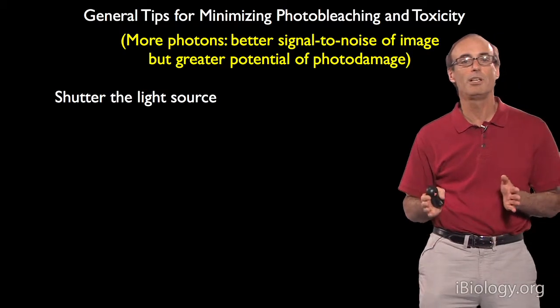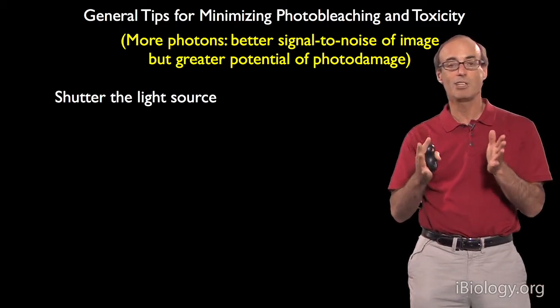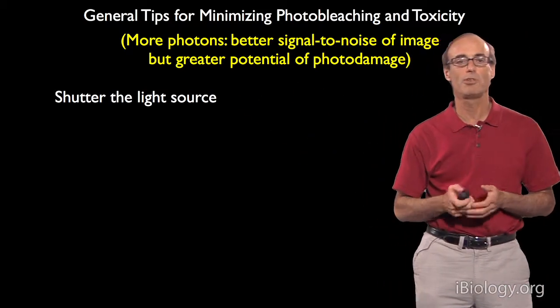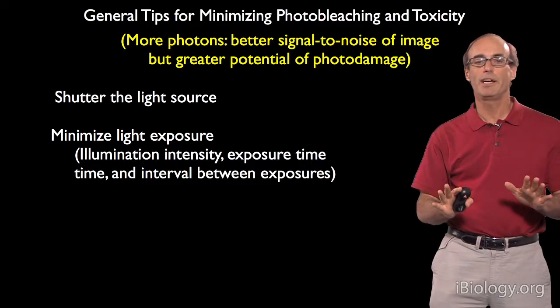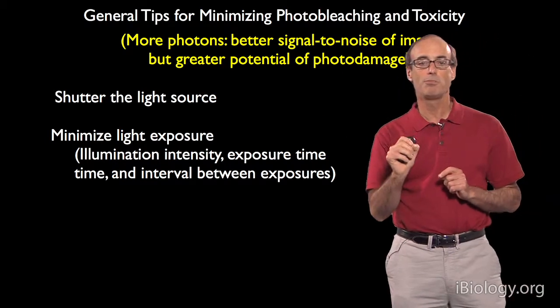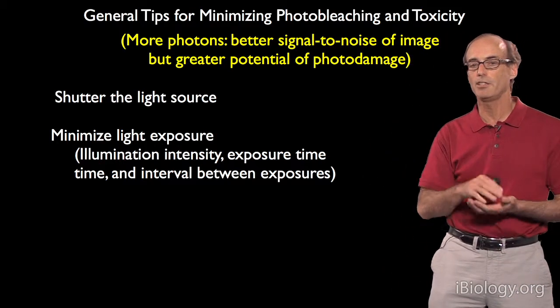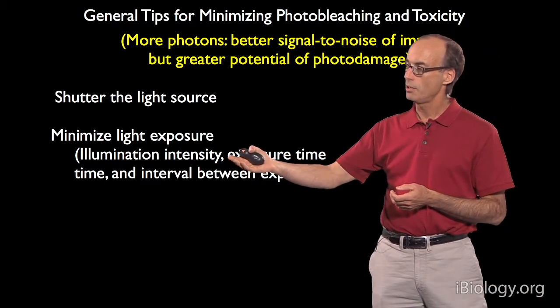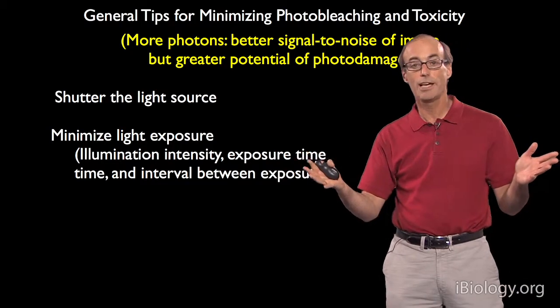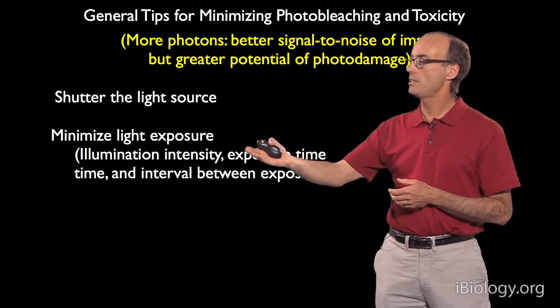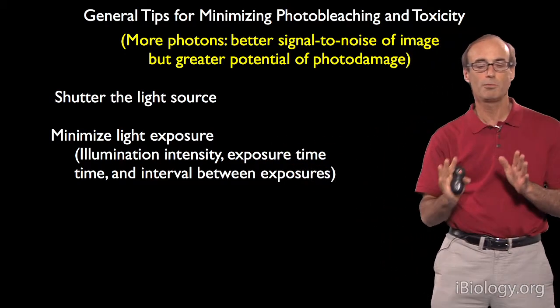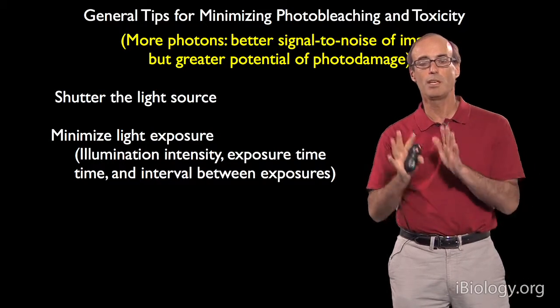There are several things we can do. First, shutter the light source — during times when you're not actively collecting an image, the light source should be turned off. There are many ways to shutter and control the light source with a computer. Second, minimize light exposure by carefully adjusting both illumination intensity and exposure time. Together, these determine your signal. One has to balance getting a good image while not over-illuminating and potentially causing photo damage.